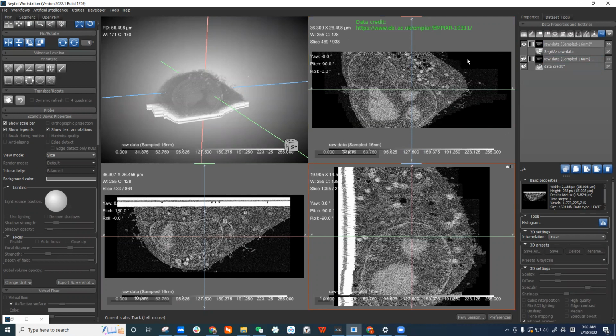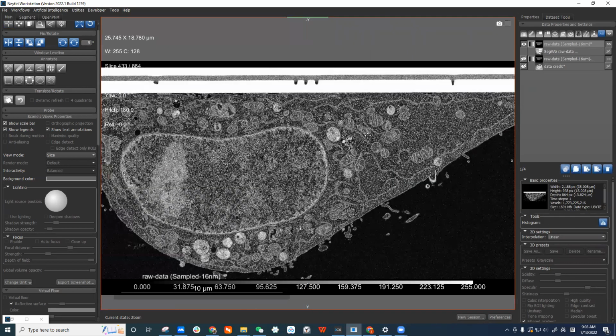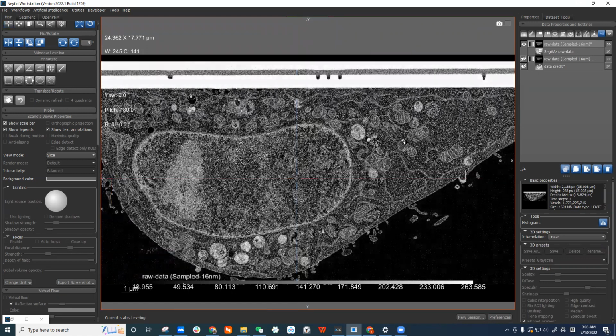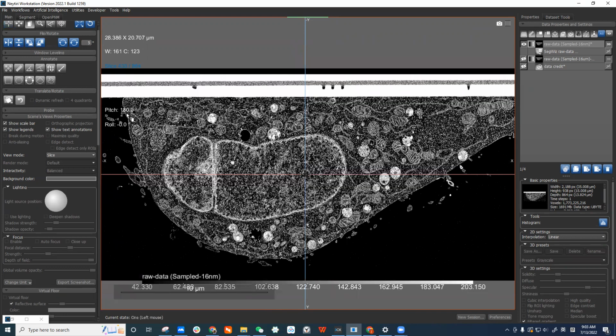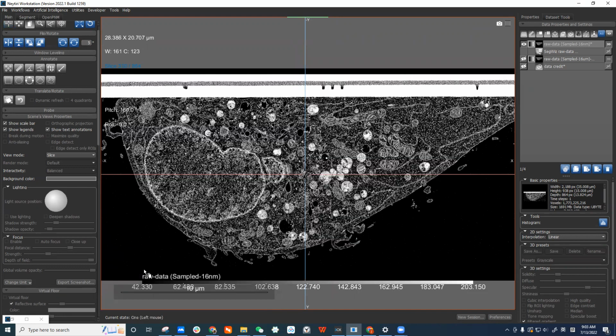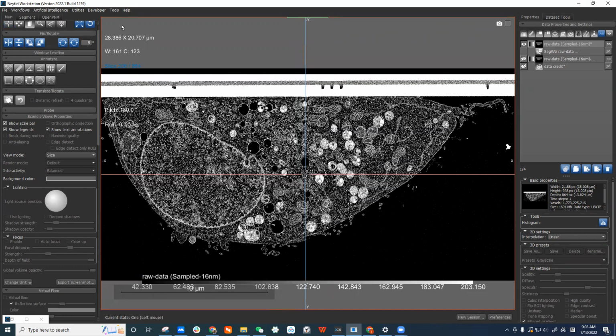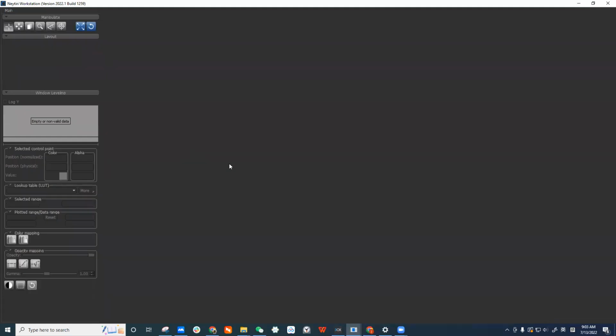What I wanted to demo is the slice registration. There's nothing very fancy today. I just want to demonstrate the basic workflow for FIB-SEM data. This one doesn't have much artifact like the stripes. Maybe it has been corrected first, but we see a lot of shifting from slice to slice, drifting. So the first step is to do the slice registration.